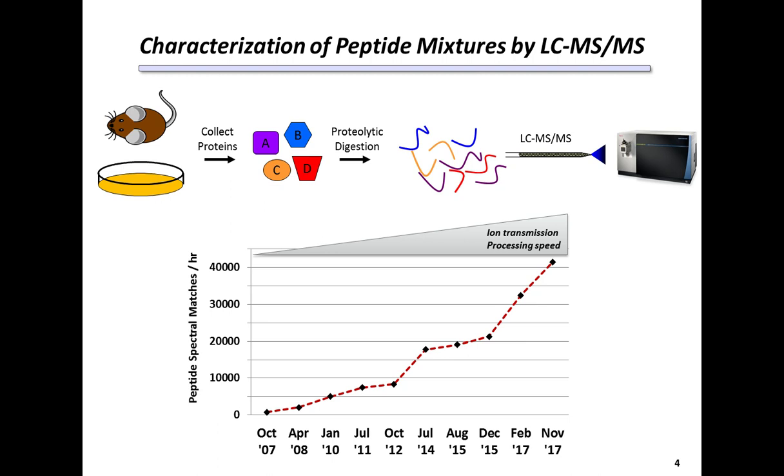Now, the ability to study proteins in the cellular environment has advanced rapidly over the last 2 decades, in large part due to technology advances, particularly in the area of what we call LC-MS-MS, or liquid chromatography and tandem mass spectrometry. In a simplified view, you can imagine that we have a mixture of proteins, and we digest those proteins down into an even more complex mixture of peptides. Those peptides then get separated by reverse phase liquid chromatography and introduced to a mass spectrometer through a process known as electrospray ionization. These mass spectrometers can now identify thousands and thousands of these peptides per hour and give us a sense of how abundant they are relative to one another.